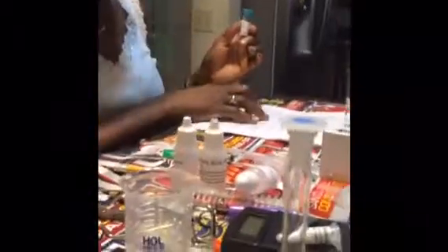Again, this is Chinyere Ogugu, continuing with the week 5 lab of synthetic fragrance esters. Part 2 of the lab. It says add 4 drops of butyric acid into test tubes 4 and 5. 4 drops. 1, 2, 3, 4.